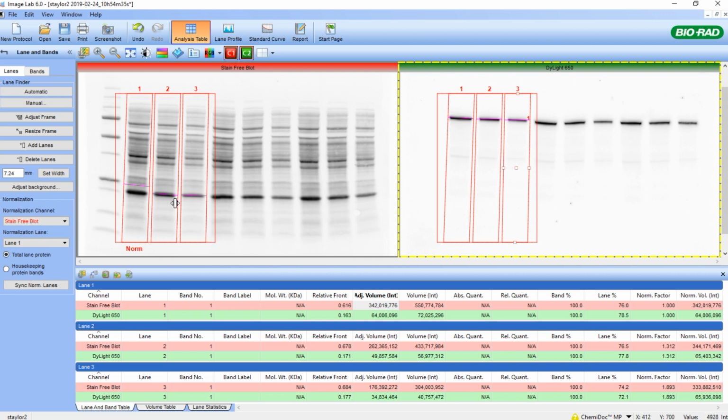Same thing where we see less signal at the bottom or top of a lane. There's a lot more noise, a much lower signal to noise in these regions, which can modify the data a little bit when we're looking at normalization. And that's why I prefer typically to choose a region of each lane where I get the best transfer and the best signal to noise for normalization.